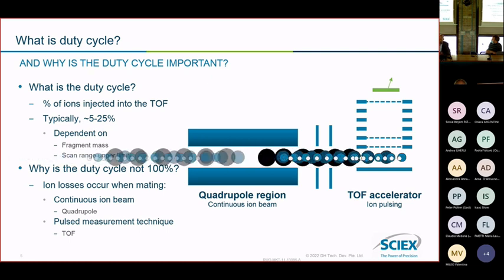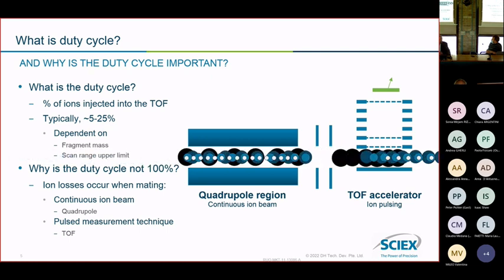And this range is related to the way the ions exit that collision cell. So if you see the animation, as the fragments exit, the smaller M/Z fragments move faster than the heavier M/Z fragments. And therefore, there's a dispersion here that means only a fraction of the ions are actually in the optimal spot to be pushed to the time of flight, and the remaining ions will be lost. So this is why the duty cycle at this part is limited for QTOF-based systems. And if you have the curiosity, you can check for every vendor. Their published duty cycle will be within this range.